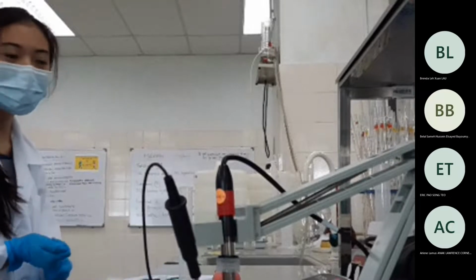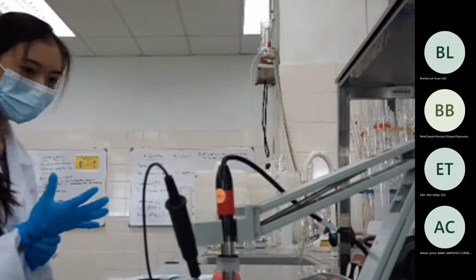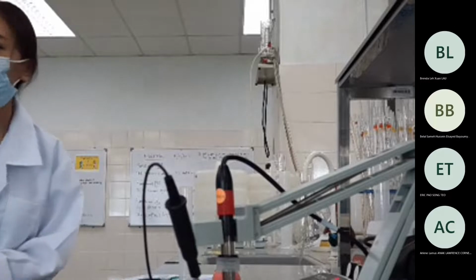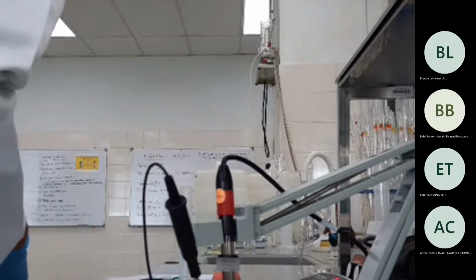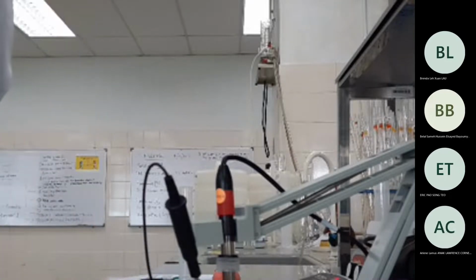Buffer. After that, we will... And for the buffer solution, we get 250 milliliter per day.